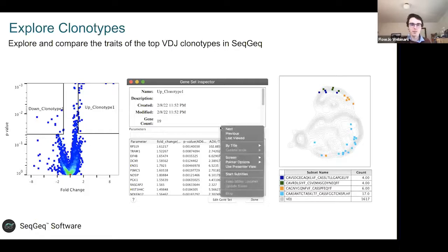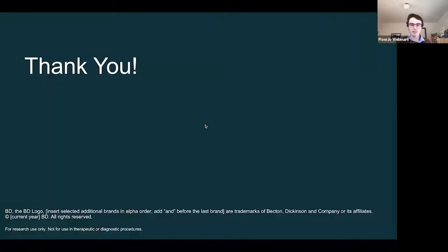Okay. So I think that was it for the slides. I'm going to jump now into actually using the SeqGeq plugin and looking more at VDJ. If you have any questions, I've been going kind of fast, feel free to drop them into the chat or the Q&A, and I'd be happy to answer them.